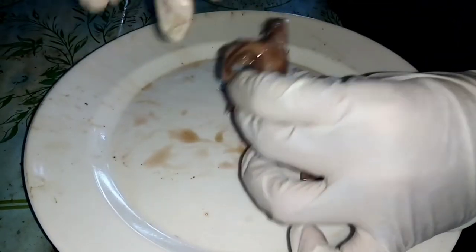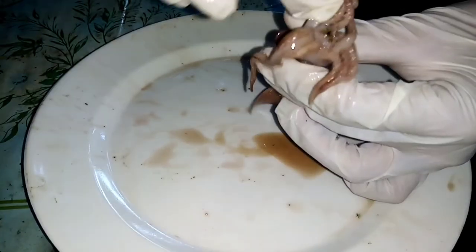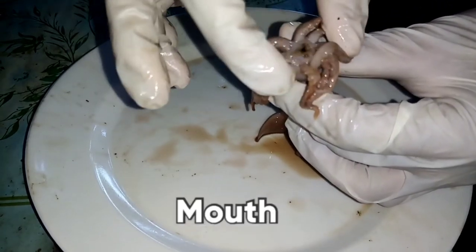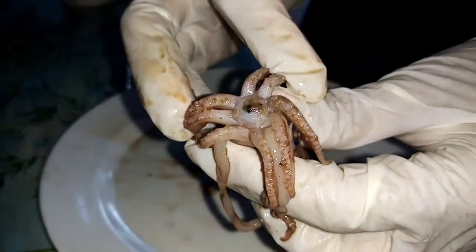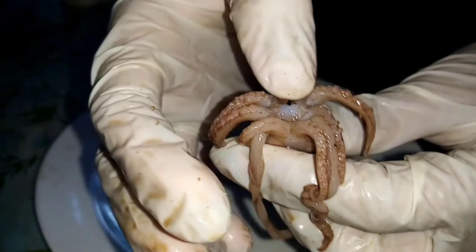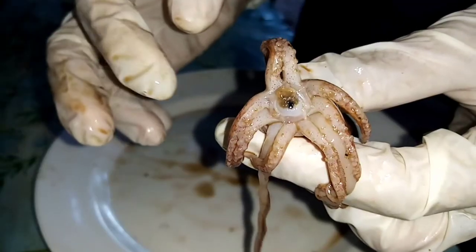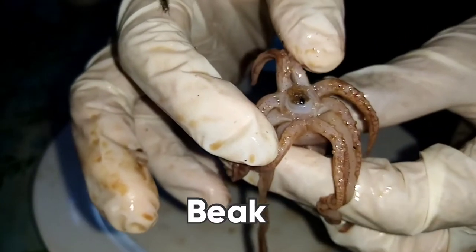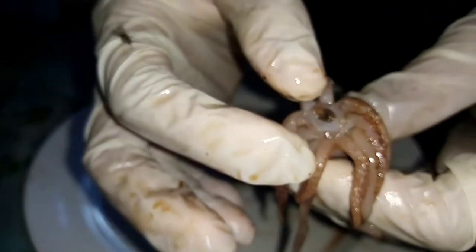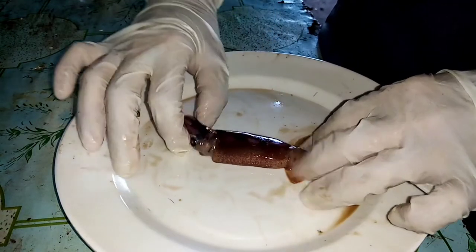And lastly, that I can identify is the mouth. As you can see there is a black dot inside the mouth, it's called the beak. So it is the beak. Later on, I'm gonna remove this one, the beak. Now I'm gonna proceed in identifying the internal parts of this squid.